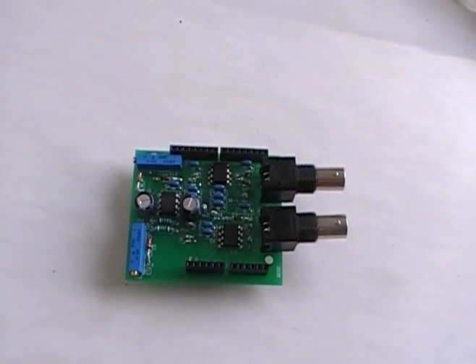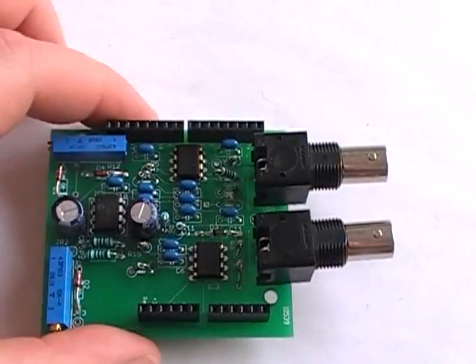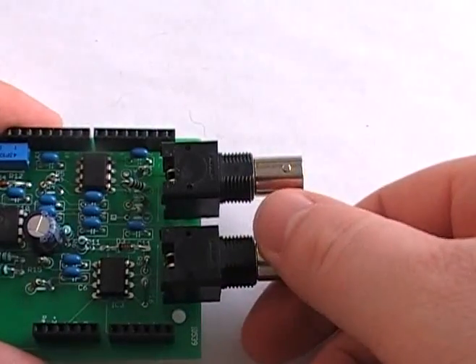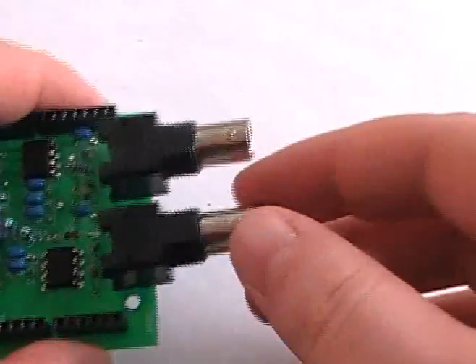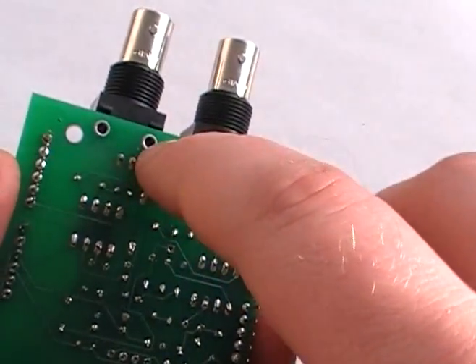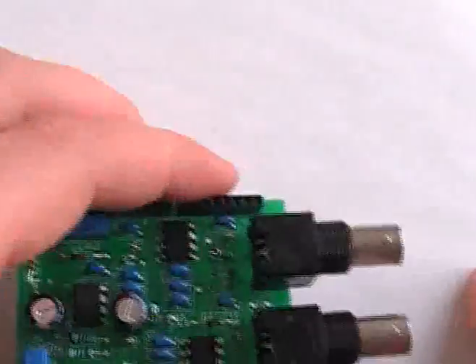This is the Forp Duino. It has a pH and an ORP circuit on it. You can see we have the two BNC connectors, so you can just screw on both the pH and the ORP probes right onto it. You'll notice that they're a little bit wobbly — that's just because I have not put the screws in the bottom yet; I have to find a size that fits.